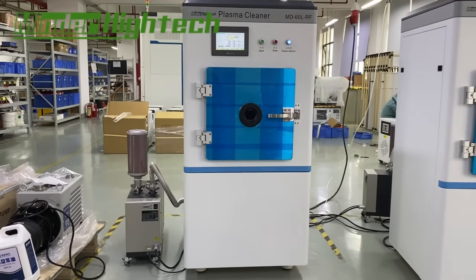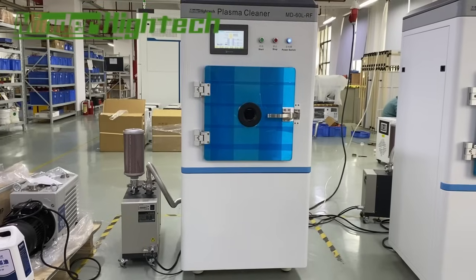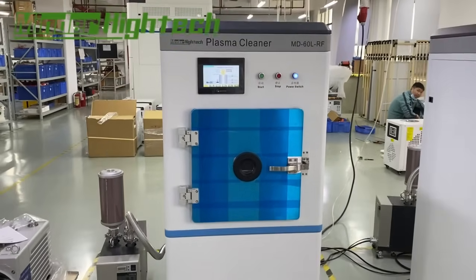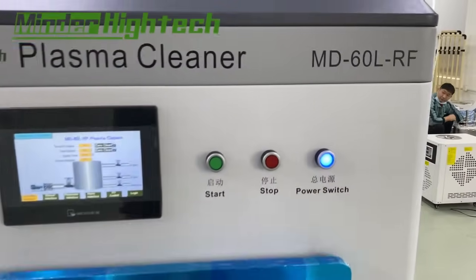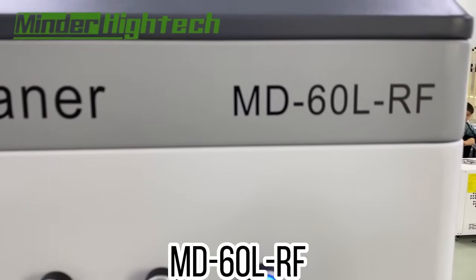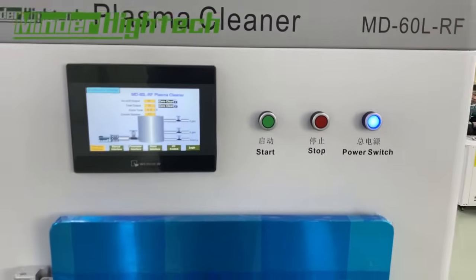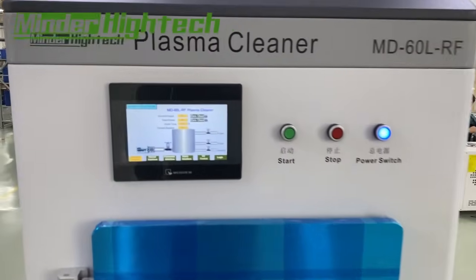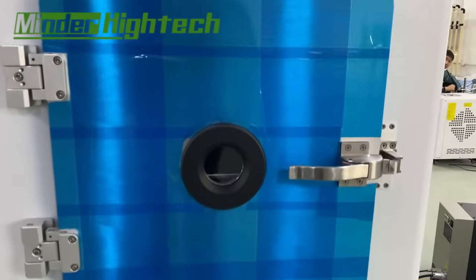Today we introduce the vacuum plasma cleaner, or we call it surface treatment MD60. The frequency is higher. This is the touch screen, and this is the vacuum cavity area.